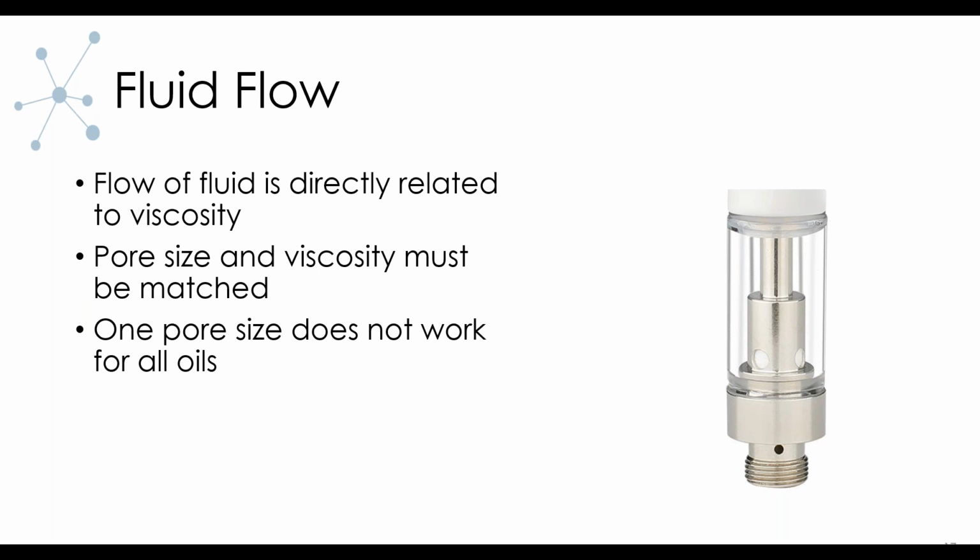And so now what I'd like to talk about is fluid flow. If you recall earlier in the talk, I spoke about how fluids can be Newtonian or non-Newtonian. And just a reminder, with non-Newtonian fluids like cannabis oil, viscosity changes as the fluid flows. Another way of looking at it is once the fluid begins to flow, there's a certain amount of force put upon the oil.